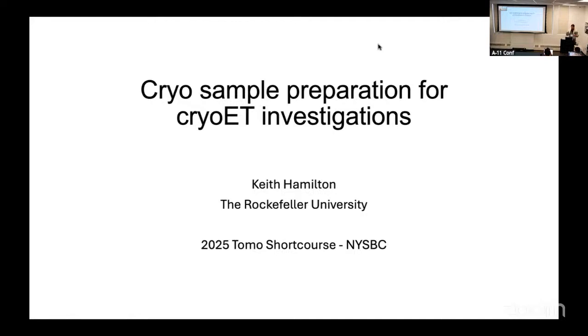So I'm going to talk about sample preparation. Basically, taking it from your sample, I'm going to focus on cells. You have cells, and how do you get them frozen? How do you get them onto an EM grid? What are the considerations you have to think about? And what are some pitfalls you might run into, and what are some things that you might be able to do with it? So through the talk, I'm going to go over the background and how you do things, and then present some test cases of things that I've done to show you things that can go wrong and things that can go right.